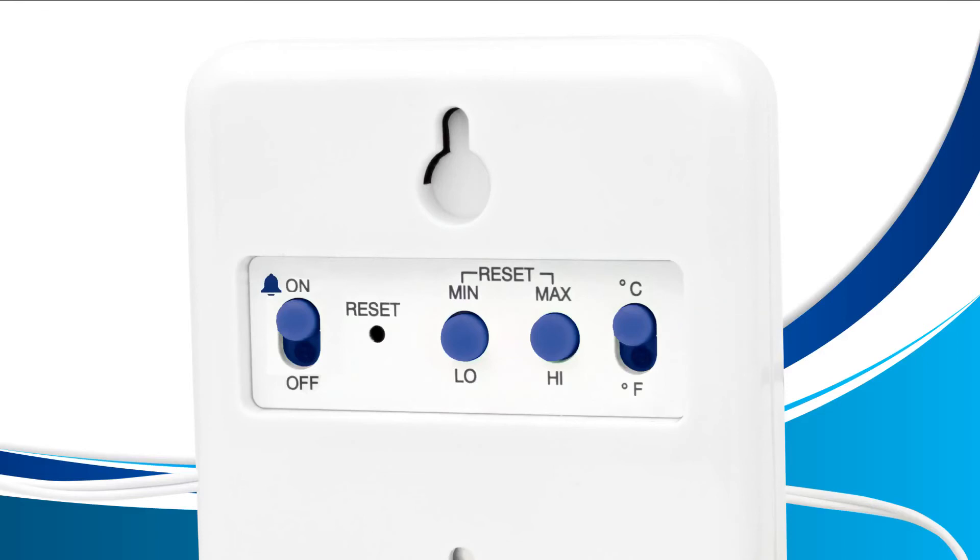If you prefer your temperature to be displayed in Celsius, leave this switch up. If you prefer your temperature to be displayed in Fahrenheit, move the switch down towards the letter F.